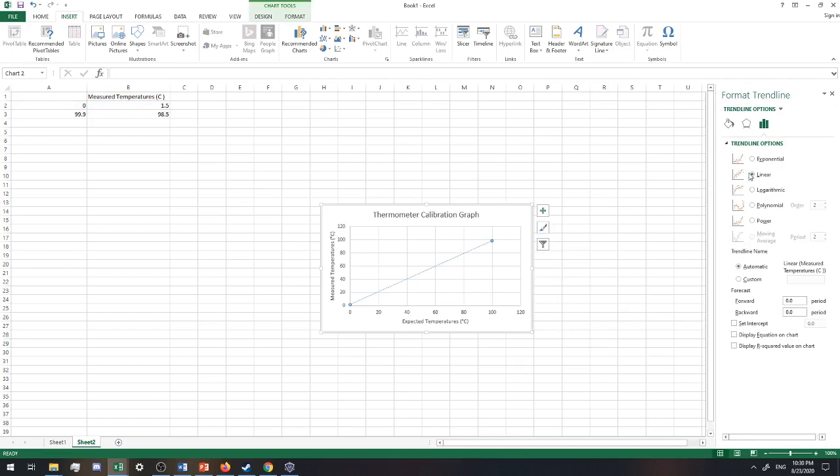In this course, we're going to stick with linear trend lines. There are reasons why you could do a match for non-linear sets of data, but we're not going to work on those because we don't do enough to talk about why a certain trend would be better than another and how to tell if it's a good fit or not, or if it just happens to look nice but it's poor. So that's going to give me the line through it.